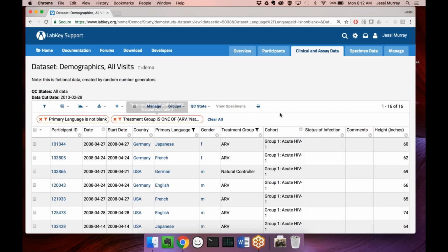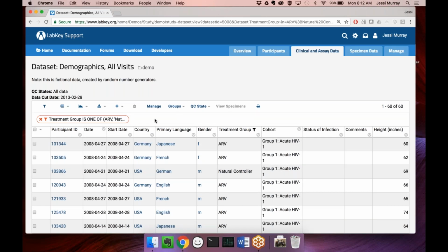And your filters will just kind of stack in this area until forever. You can also do a quick remove and update that way. A lot of what our users do is manipulating data grids, and we wanted to make some of the common actions a lot easier.